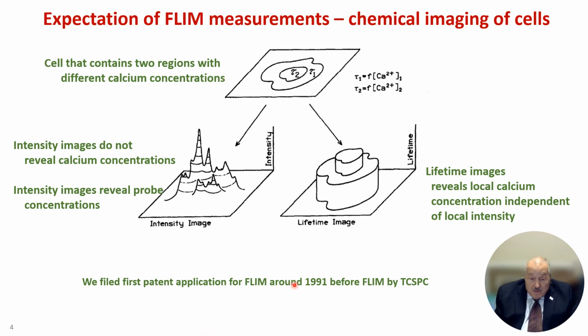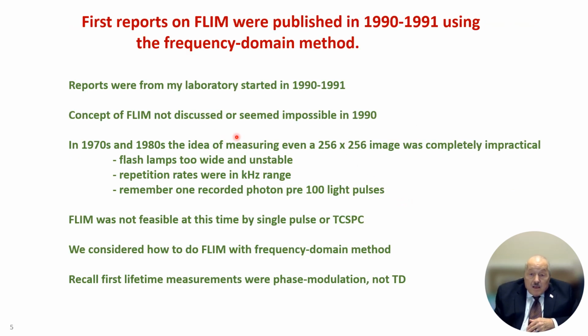To the best of my knowledge, we were the first group to understand that FLIM was possible. When this idea first came out in the 1990s, it was really considered almost impossible.